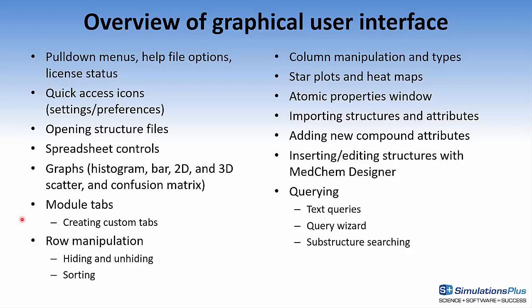Next, I'll talk about manipulating the rows, hiding and unhiding, and sorting them. Similarly, I'll then talk about manipulating the columns and the different types of columns you can have. Two examples are star plots and heat maps. I'll also talk about the atomic properties windows, then go on to importing structures and attributes, adding new compound attributes, inserting and editing structures with MedChem Designer, and then finish up with a discussion of querying the spreadsheet — either text queries, using the query wizard, or performing substructure searches.